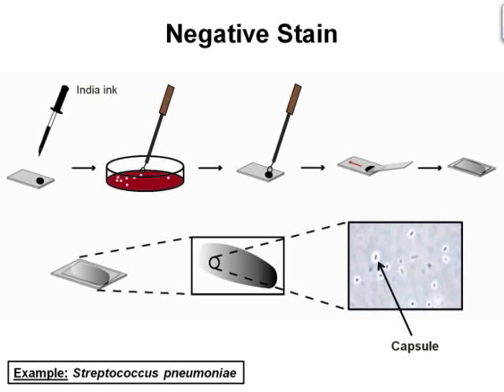First, place a very small drop of India ink on one side of the slide. Transfer a portion of a colony from the culture plate to the slide. Place the edge of a cover slip on the drop of India ink containing bacteria and gently slide the edge of the cover slip across the slide so as to create a concentration gradient of ink and drop the outer edge so the slip covers the slide. The India ink should be spread across the slide in a thin layer. The smoky gray area of the stain indicated with a circle here is the area for viewing under the microscope.